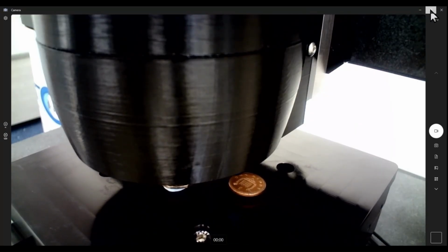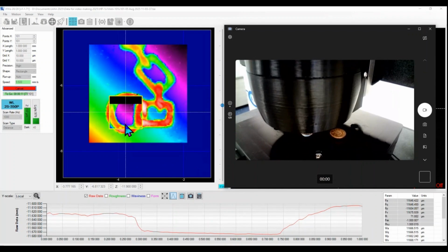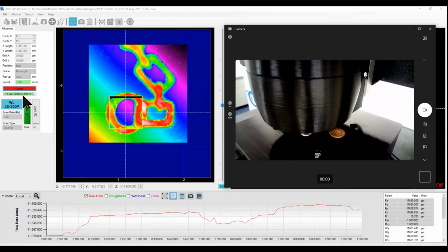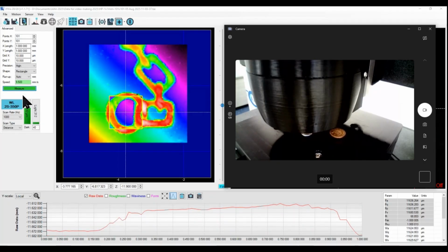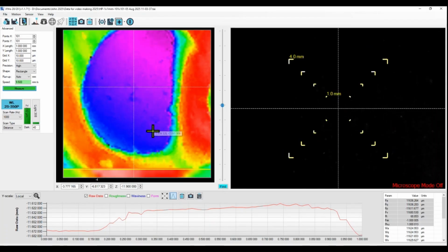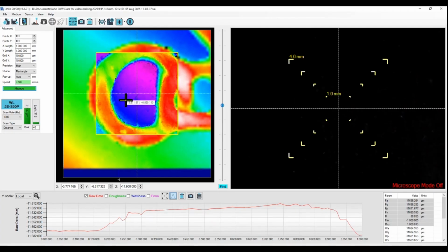And let's reduce that again. And you can see this area is filling up. So 5 seconds to go, the timer is here. You'll hear a noise saying the measurement's finished. And there it is. Okay, so let's zoom into this. So we're zooming in now, going into much closer detail about the image that we're looking at.